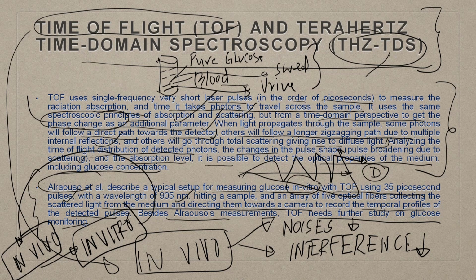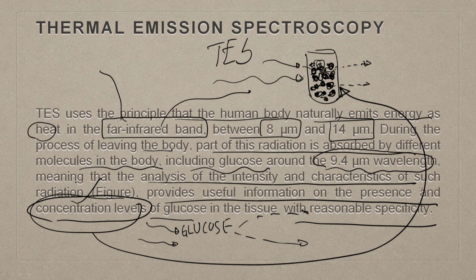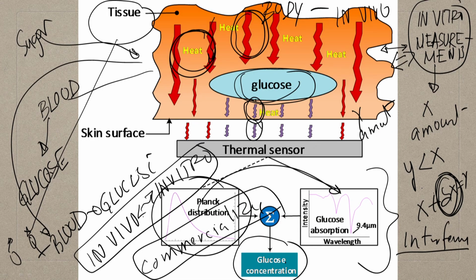Same as what we discussed about time of flight and terahertz domain spectroscopy, the same is true for far infrared spectroscopy. While most of these technologies are of immense importance, they are extremely challenging. Yet, there are places where these technologies could be utilized in a very different context.